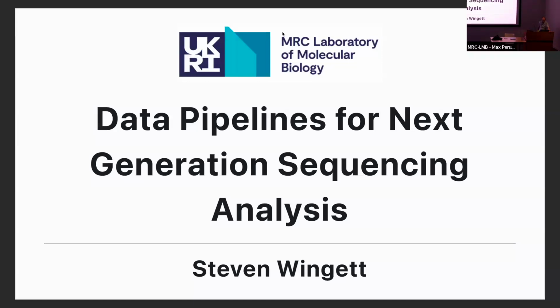So in this talk, we'll be looking at the initial processing steps, i.e. how to take files produced by a sequencer and convert these into data sets that can be easily interrogated to extract meaningful biological findings. So if you're planning to perform an NGS experiment yourself, I hope this talk is going to be useful. But even if you're not, you might find that during the course of your research, it sort of changes tack and you actually do need to do some sort of NGS experiment. So hopefully it'll be useful for you as well.